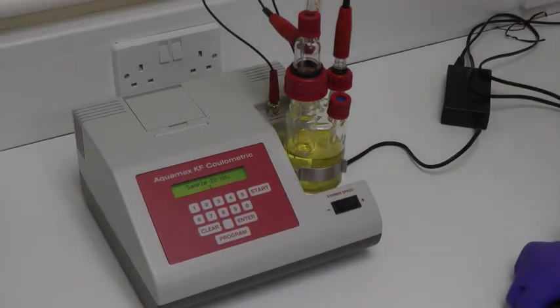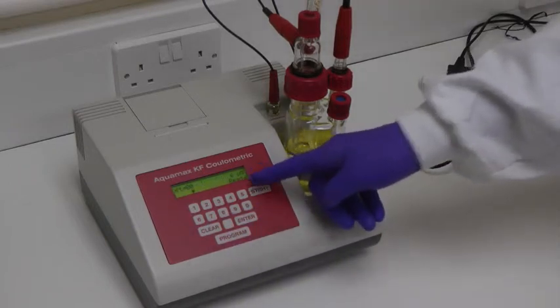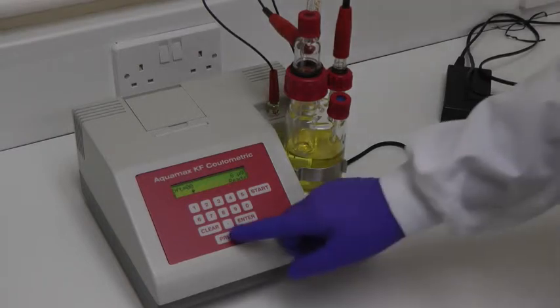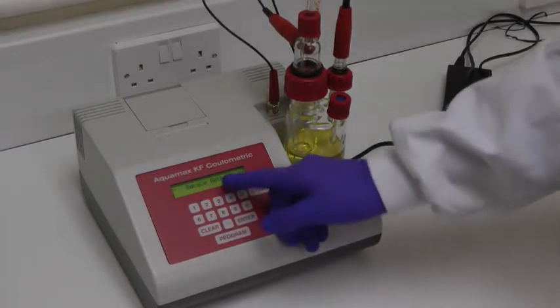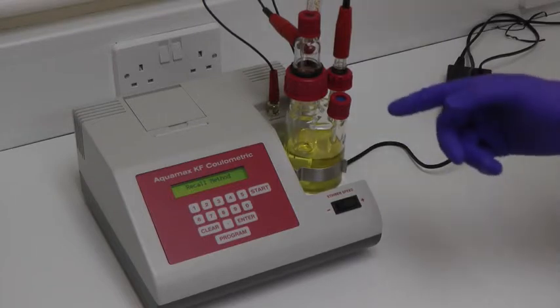If the sample ID number is the only parameter to be changed, press Clear, and the unit will return to the ready mode. It is not necessary to scroll through unwanted parameters. The second parameter is Recall Method. Methods can be stored in memory to avoid reprogramming from scratch.